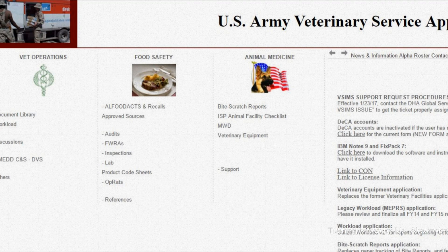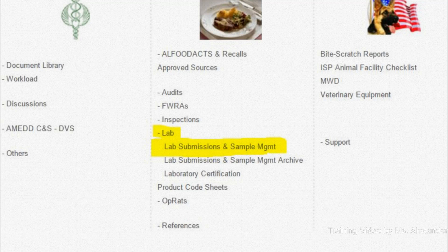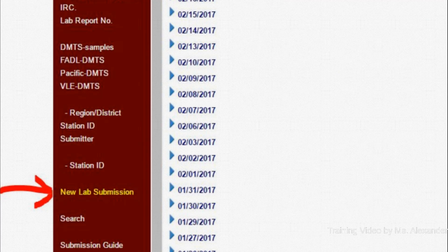Go to the Application Portal, click Lab, then choose Lab Submission and Sample Management. Once there, click New Lab Submission.